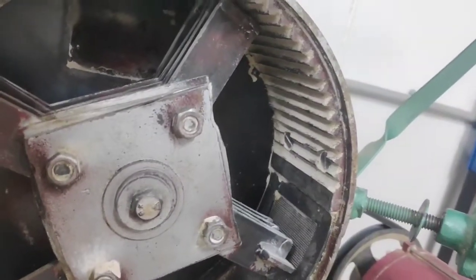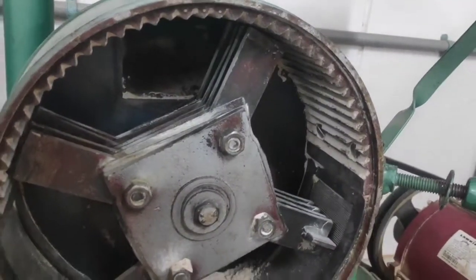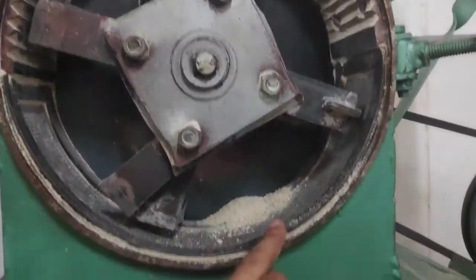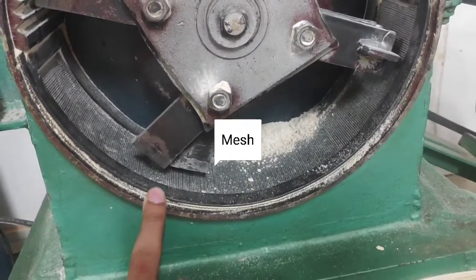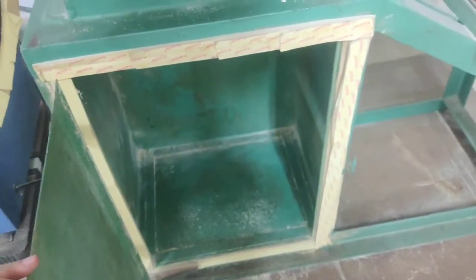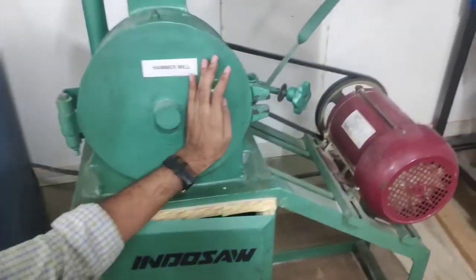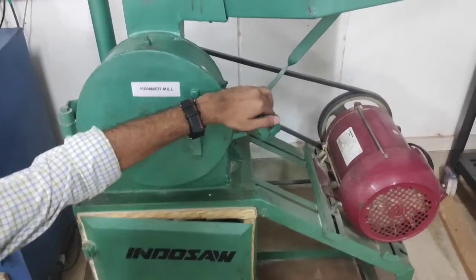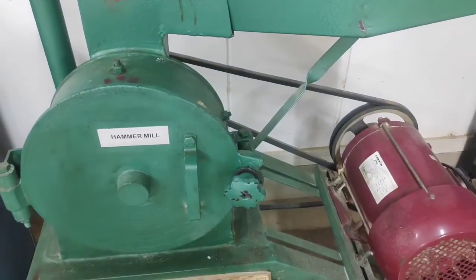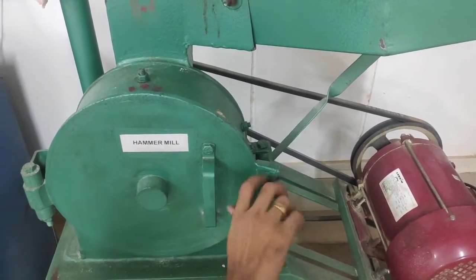The chamber has a corrugated lining in which the feed comes, and due to the impact forces it is broken down to fine particles. The chamber also consists of a fine mesh of 100 micrometers. The ground product can be collected in the outlet chamber which is beneath the grinding chamber. A small knob is provided to tightly enclose the grinding chamber so that there is no leakage during the grinding process.